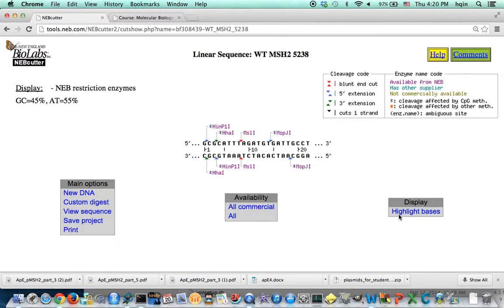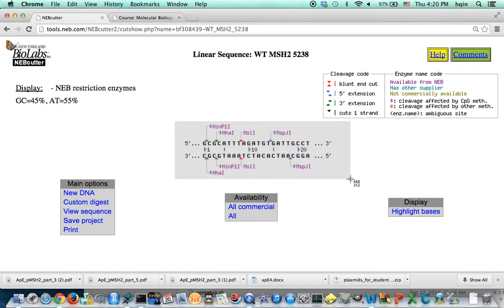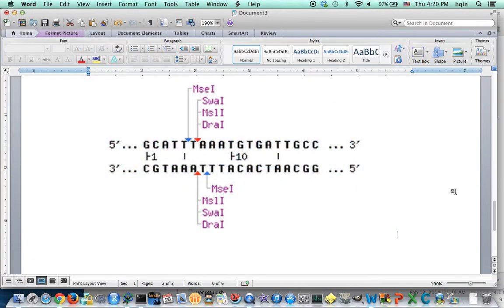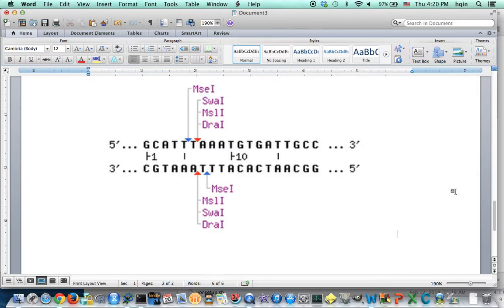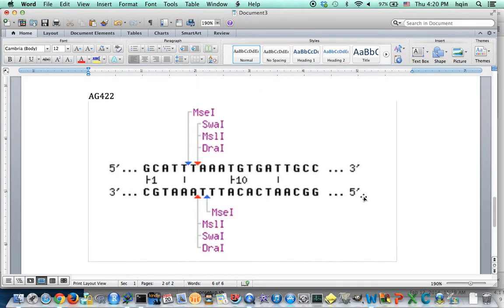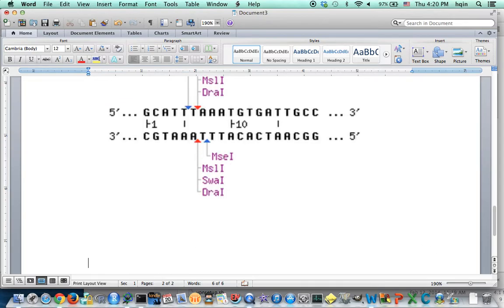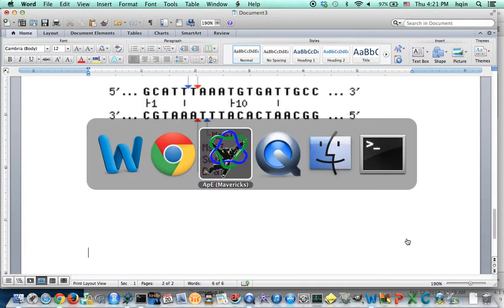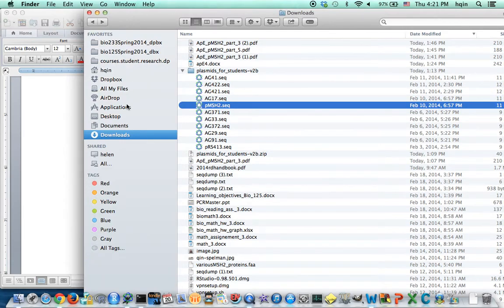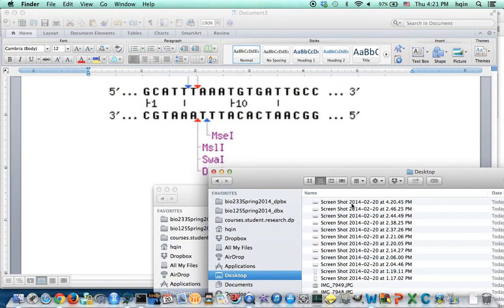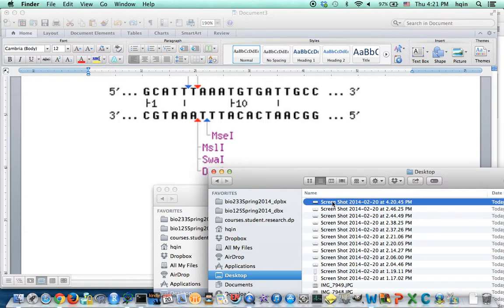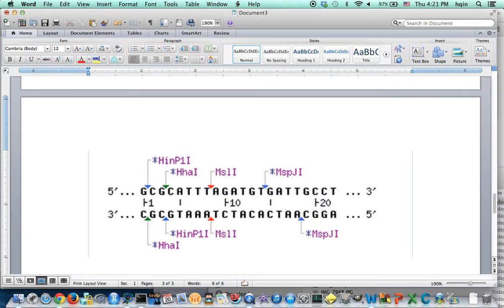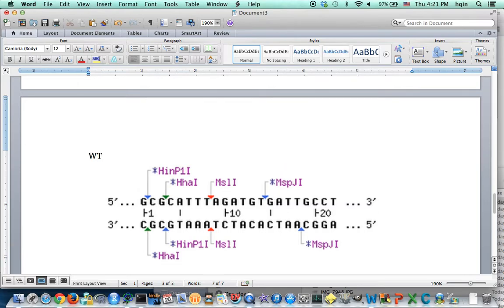So this is how the wild type is cutting here. So I'm going to copy this picture and then save it to a Word document. And on PC you may have different screen copy function, but this is wild type.